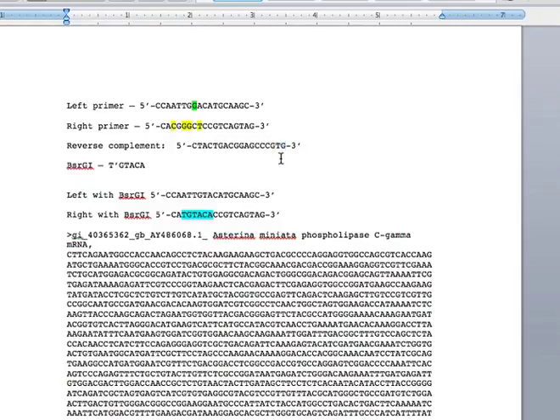The GT binds to the CA. And then here, instead of this little stretch of 6 nucleotides there, 1, 2, 3, we have to change that to read, it's going to be the reverse. So that'll be TGTACA as well. And so we need to change that in the sequence down below.